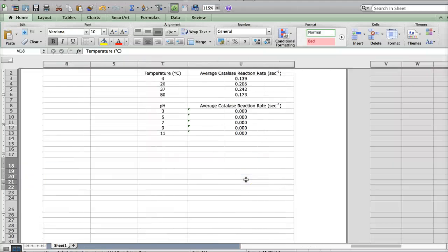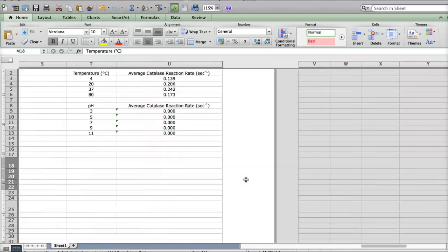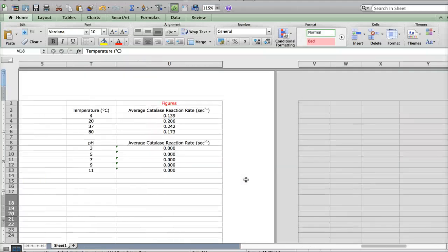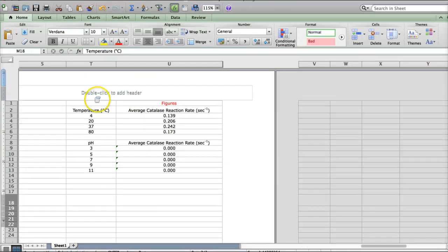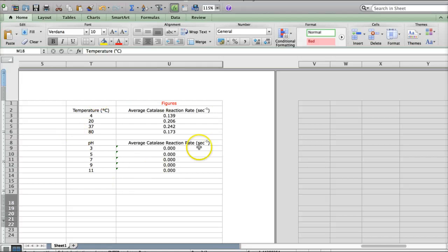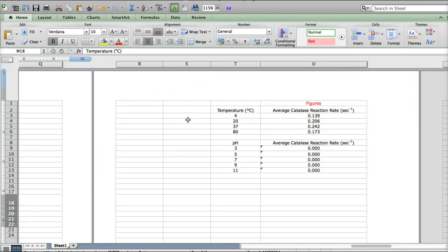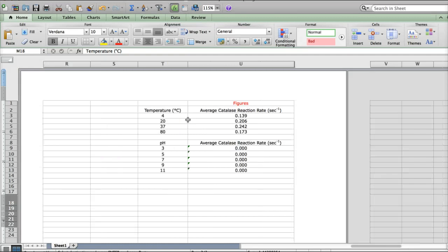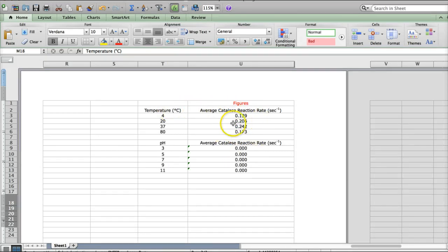Scroll over here to this last part of the file, which is the part where you make the figures. What I've done with this Excel file, this Excel spreadsheet automatically takes the average values from your graph and sticks them over here, which is nice. It makes it a little bit easier.